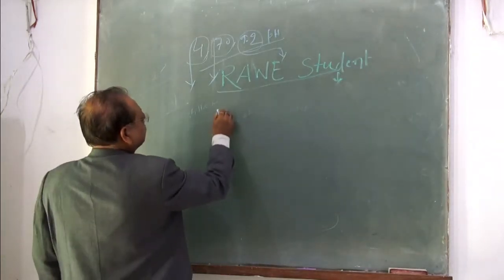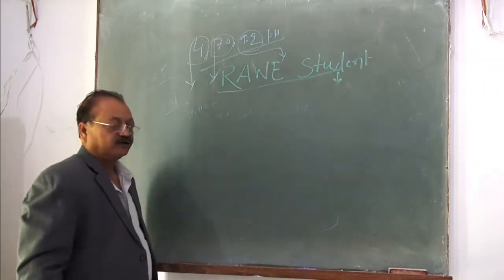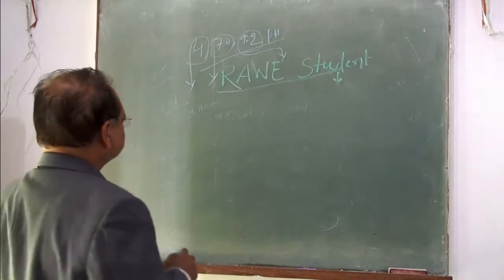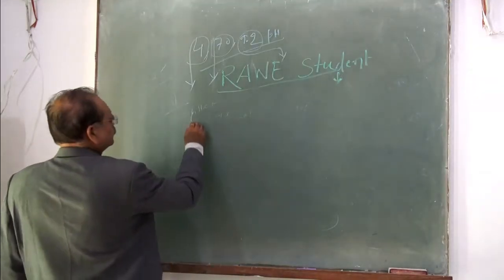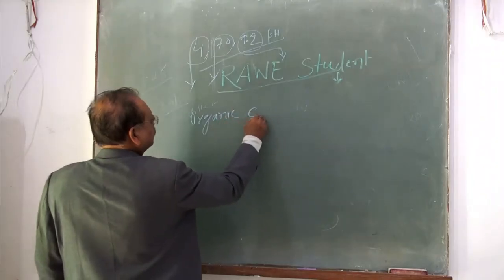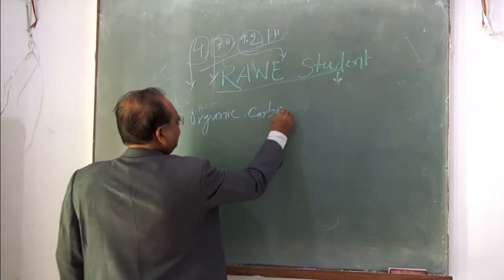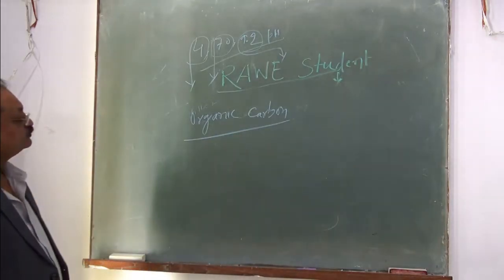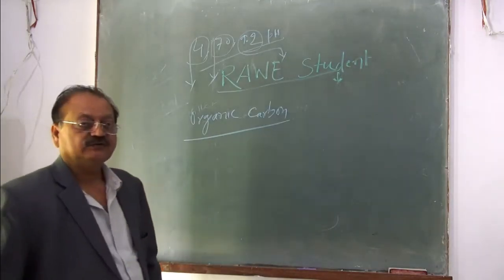Organic carbon content: determination of organic carbon of a given soil sample. What you have to do?